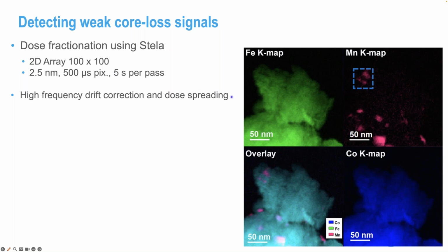If we didn't do that, it's unlikely the sample would sit still for 70 minutes. Spread the dose. We don't want to leave the beam parked for goodness knows how long, even if the sample is radiation hard. Parking the beam for very, very long periods of time is usually not the best strategy.